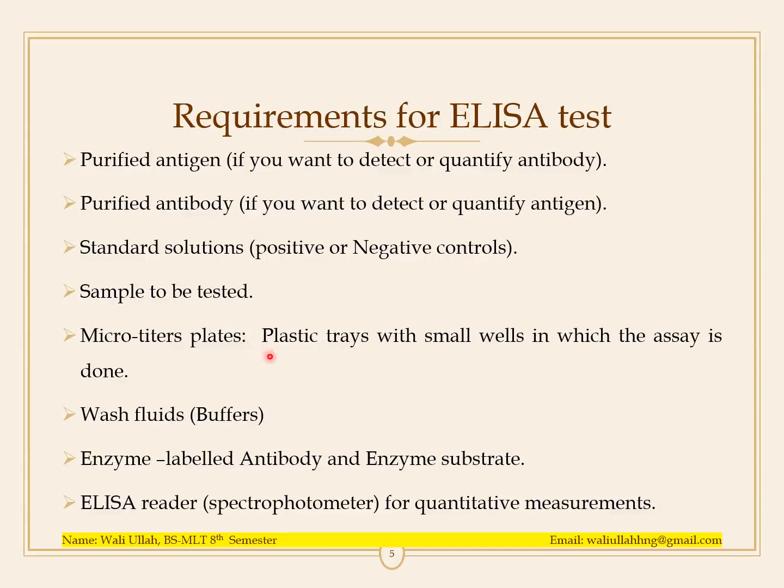Microtiter plate. It is made up of polystyrene which contains 96 wells. Wash fluids. Enzyme labeled antibody and enzyme substrate. ELISA reader, that is spectrophotometer, for quantitative measurement.